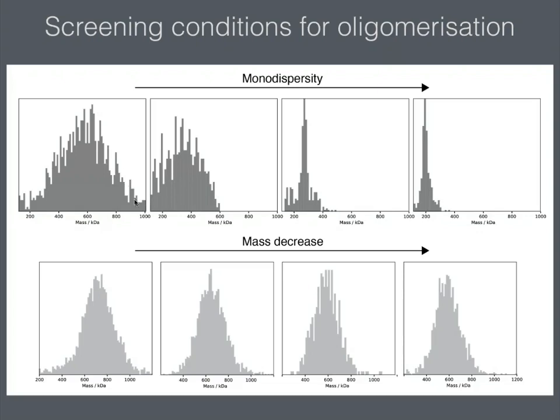The fact that you have such a large ensemble of oligomeric states coexisting at equilibrium means there are significant hurdles towards structural characterization, whereas here we can screen approaches to reduce that dispersity, such that getting high resolution structural information for the form on the right-hand side seems a realistic possibility.